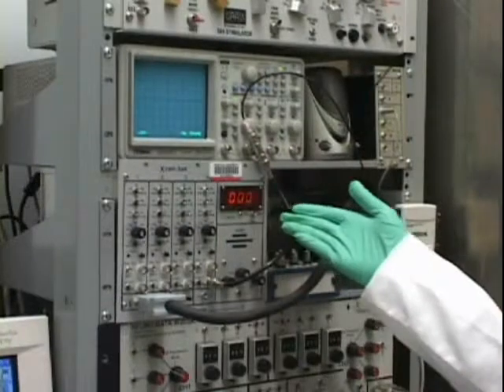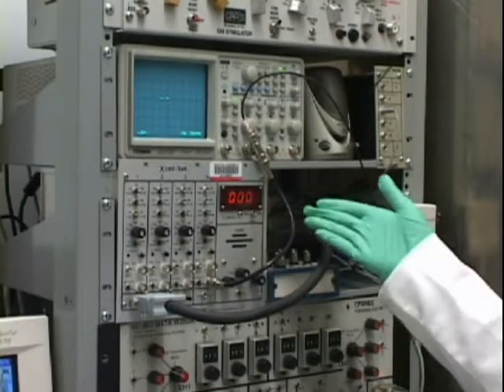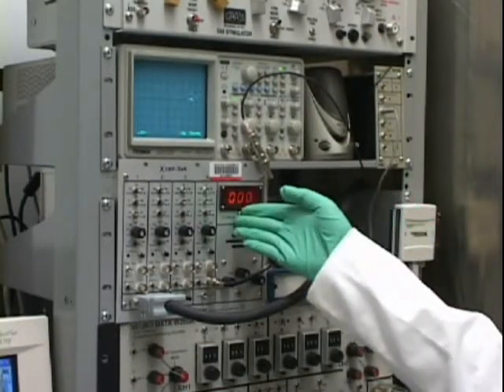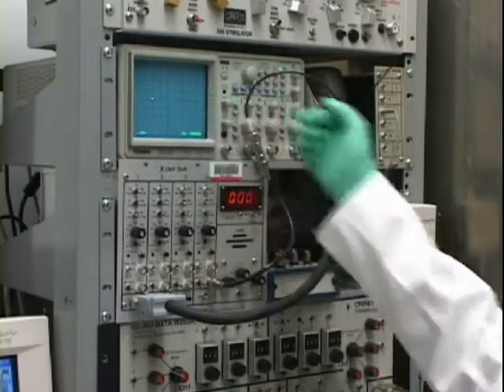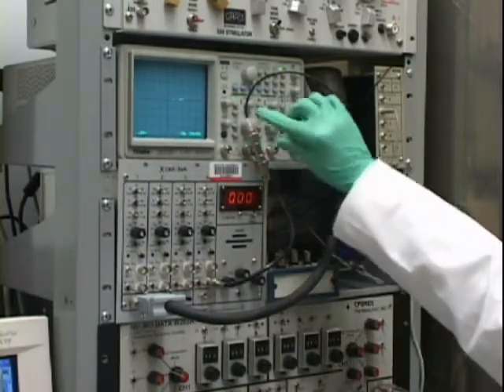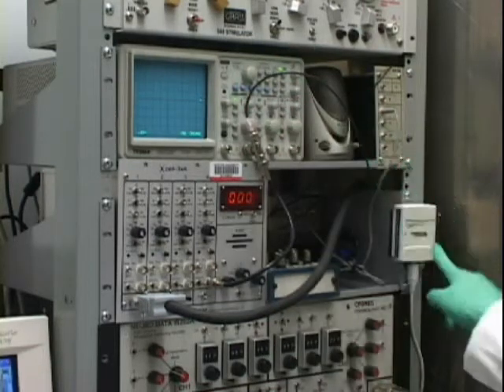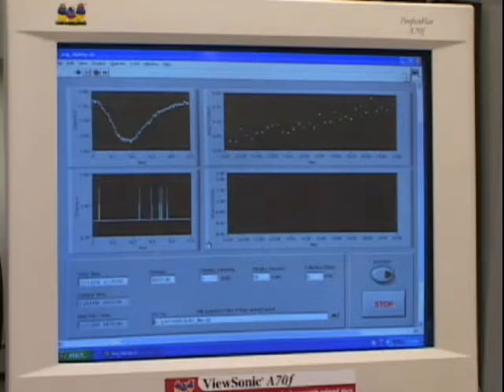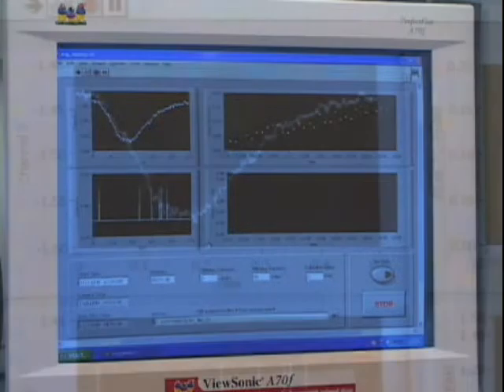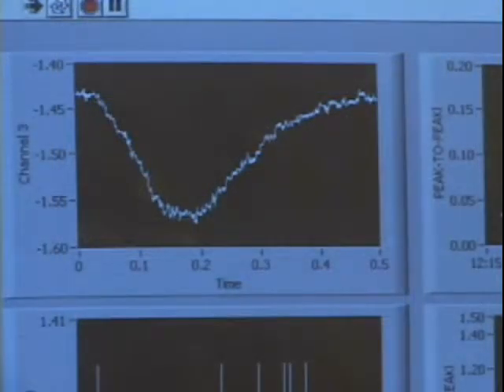The head stage is connected to the amplifier and the amplifier filter is set to pass frequencies below about 10 Hz. From there, the signal is sent to an oscilloscope for viewing and to a data acquisition board for computer analysis and storage. We use a custom-made program written in LabVIEW to deliver light stimuli from the LED and to record the ERG signal. The LED is triggered with a 100 ms pulse of 5 volts every 10 minutes.